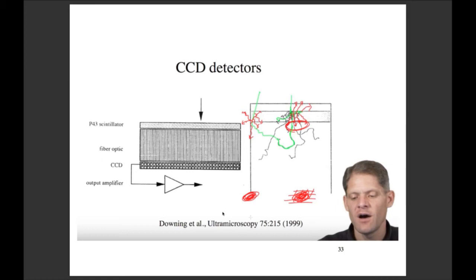This two-step process can cause a large point spread function in the readout, and maybe Ed and you guys can comment on this, but instead of individual events, it gives you counts of your electron events. Even with the way the electrons are scattered and read out in this fiber optic channel right here, you could have the same electron event be recorded as a 40 count or a 10 count. So it's not very accurate in that sense.